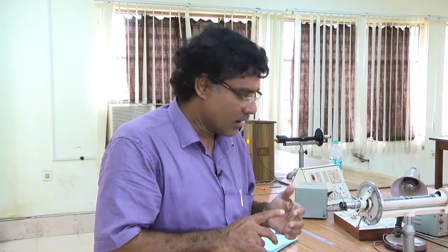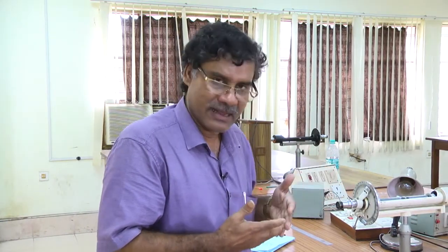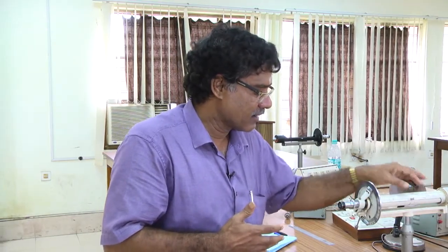Okay, we are getting 4 times uniform and 4 times this dark-bright, bright-dark, just exchanging. So, how are we getting that? That I explained theoretically, and I have demonstrated it. That is the main part to understand, and the rest of the things are easy.